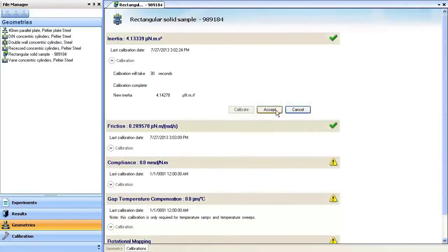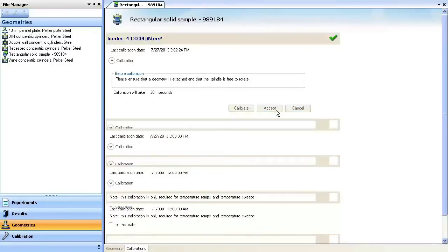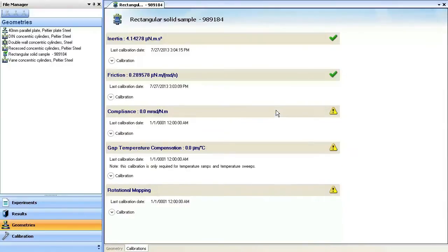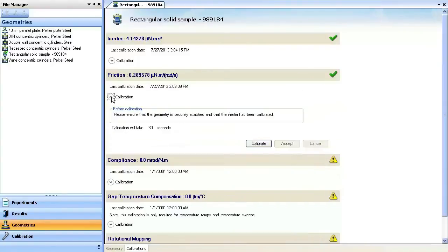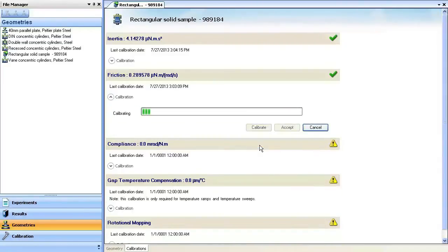After completed, accept the calibration parameters and move on to the next calibration. Expand the friction calibration and press Calibrate. Again, this calibration will take 30 seconds.